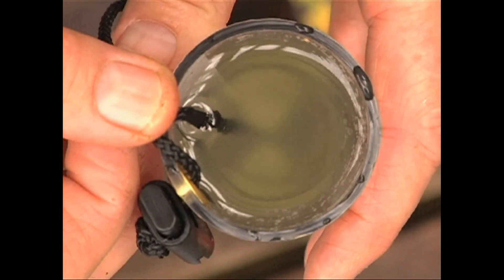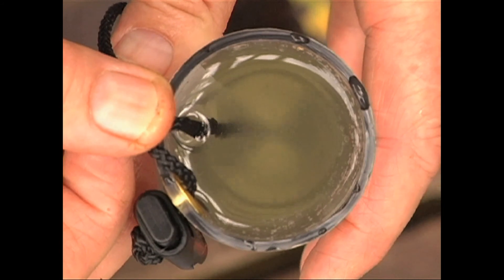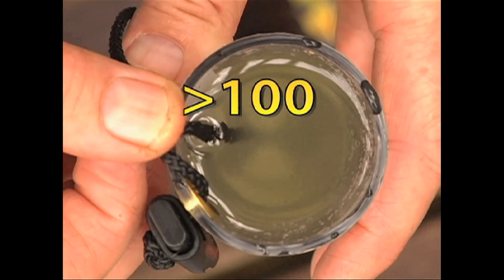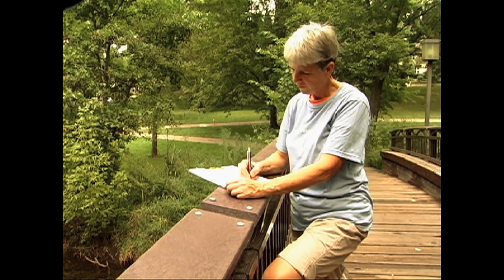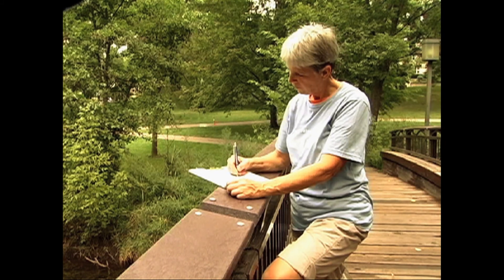If the disk does not disappear and you can see it sitting on the bottom of the tube, just record greater than 100 for the transparency measurement on your stream data sheet. Of course, if for any reason it is unsafe to take a sample, just record your observations of appearance, recreational suitability, and estimate stream stage instead.